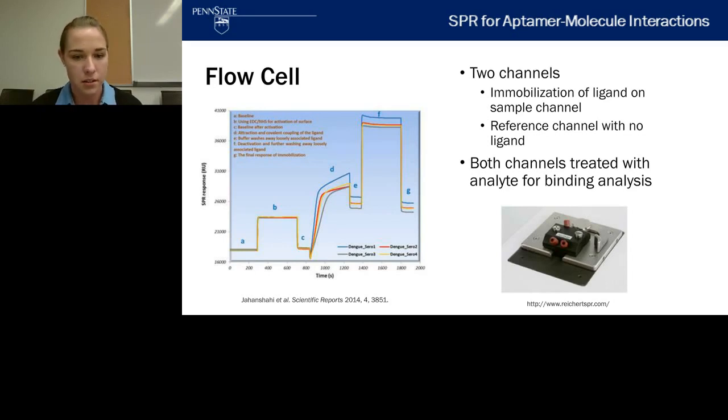ligands. In F, the group in the Scientific Reports paper here uses a deactivation step which deactivates the surface but also is used to remove loosely bound ligands. And then in G you can see that the final signal is higher than that in A, which would show that the ligands have been immobilized on the surface.